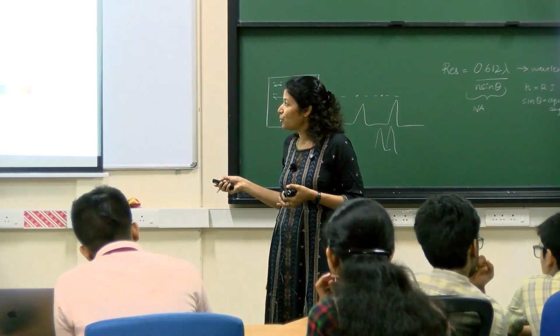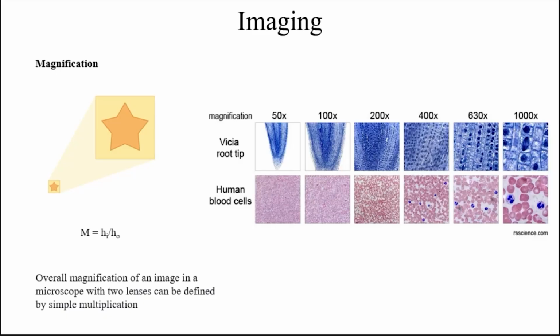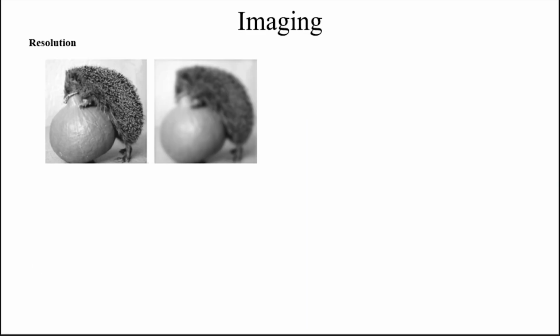Now remember, I showed you the scale before, right? So we can image up to 175 nanometers. Up to here, we can image with a light microscope. So tissues, cells, and all you can see with a light microscope. But below that, if you want to see, you cannot use light itself. So what can we do? Yeah, we can change the source of your illumination itself.